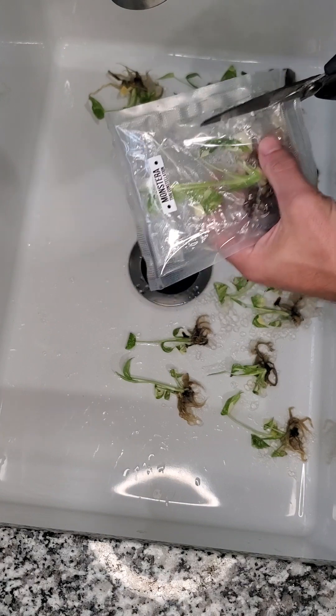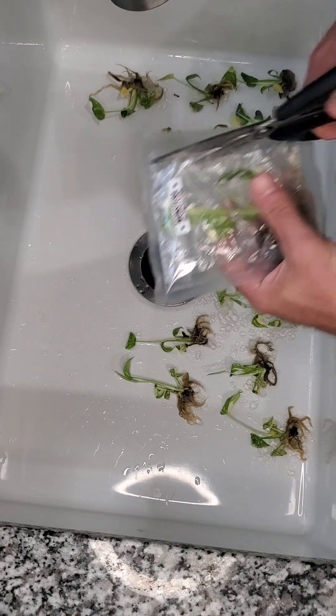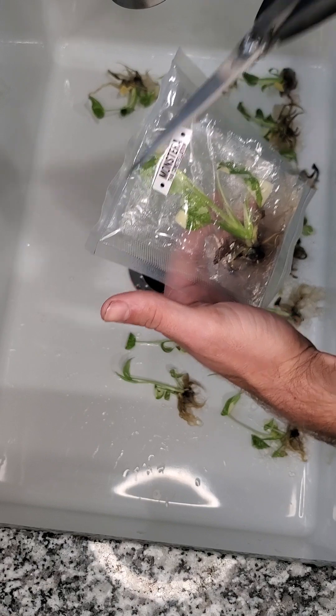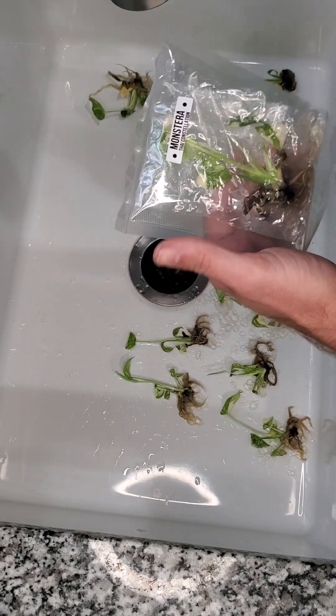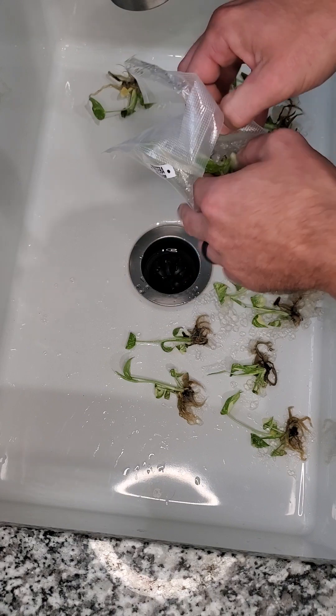The first thing you want to do is cut the bag open. I typically do it on the side because a lot of times the growth will be all the way towards the top and you don't want to accidentally cut off the top leaf. So I open the bag, pull it out, and set that aside.